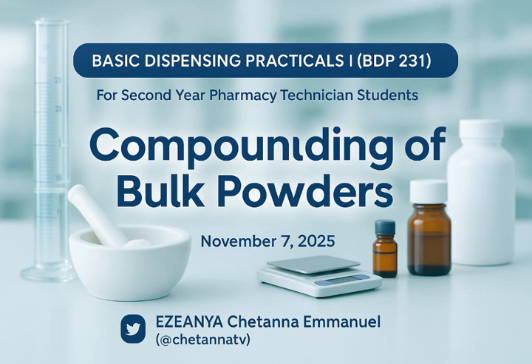Put this 5 grams here. Don't carry the whole B and pour. Weigh exactly 5 grams of B and put it here. Then mix them in one direction, and don't apply too much pressure. Just mix them properly. When they are properly mixed, what is here is now how many grams? 10 grams, right?